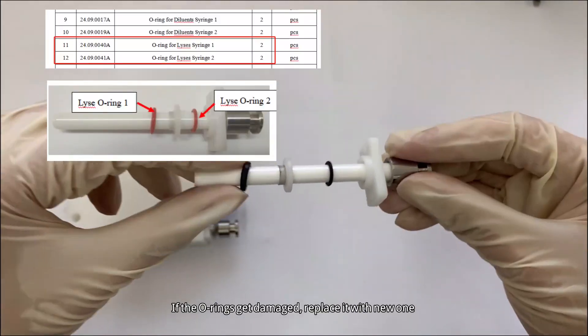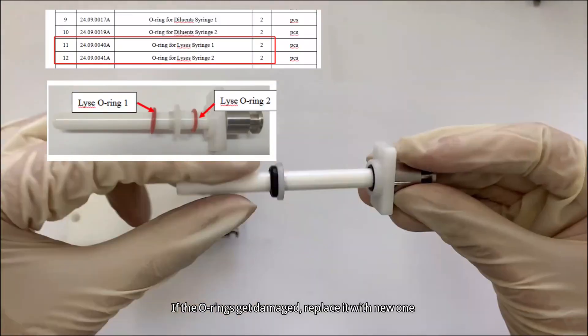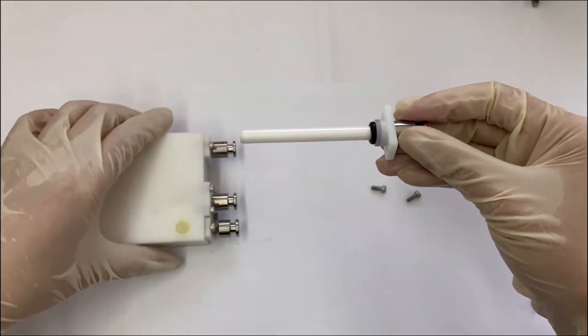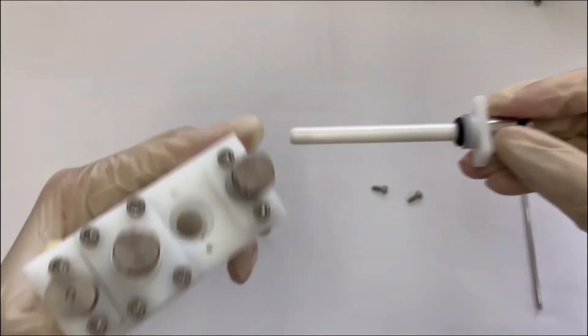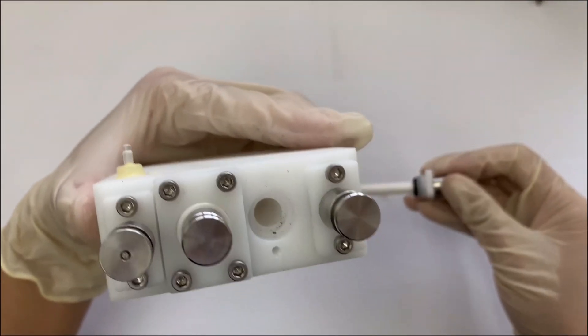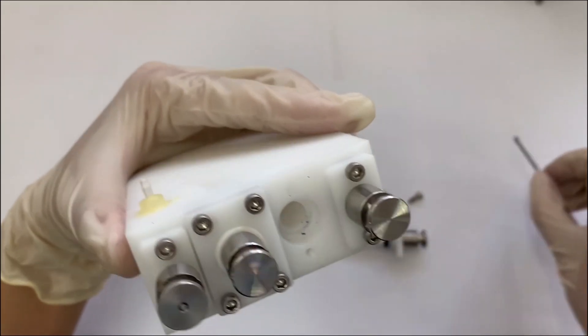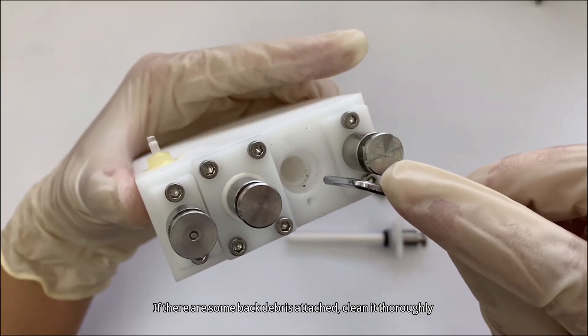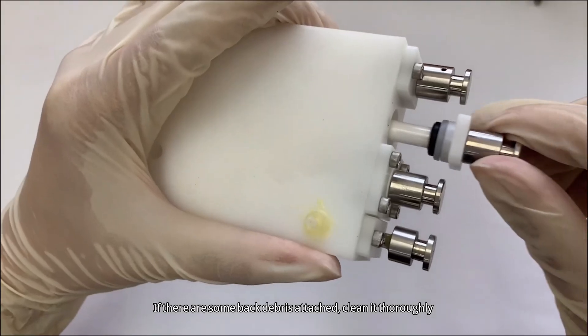If the O-rings get damaged, replace them with new ones. If there is some black debris attached, clean it thoroughly.